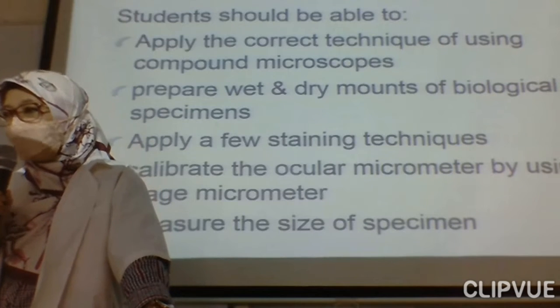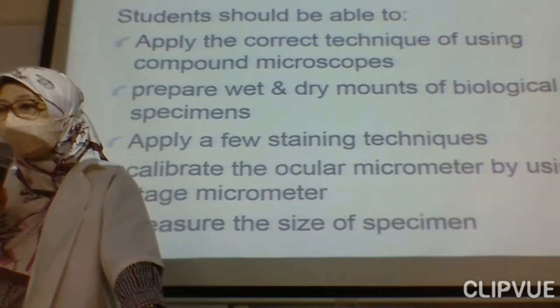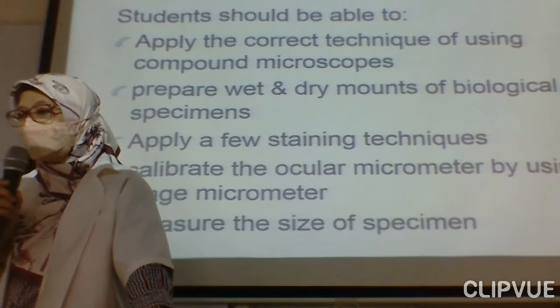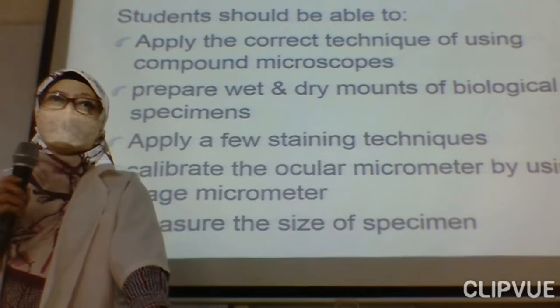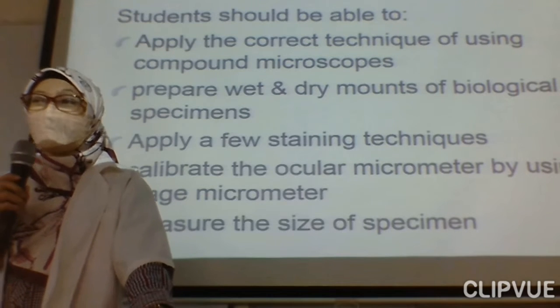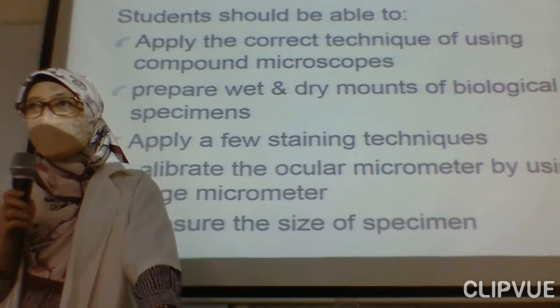Prepare wet and dry mounts of biological specimens, apply a few staining techniques, calibrate the ocular micrometer by using the stage micrometer, and measure the size of the specimen.